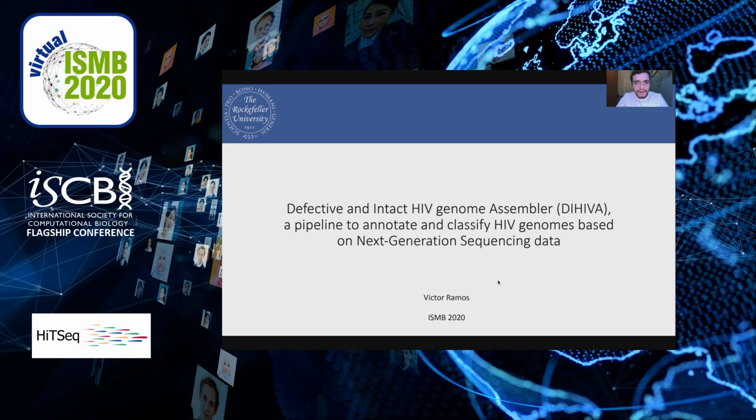Today we're going to talk about how we are capable of annotating and classifying thousands of HIV sequences using our computational pipeline. My presentation is entitled Defective and Intact HIV Genome Assembler, DIHIVA, a pipeline to annotate and classify HIV genomes based on next-generation sequencing data.